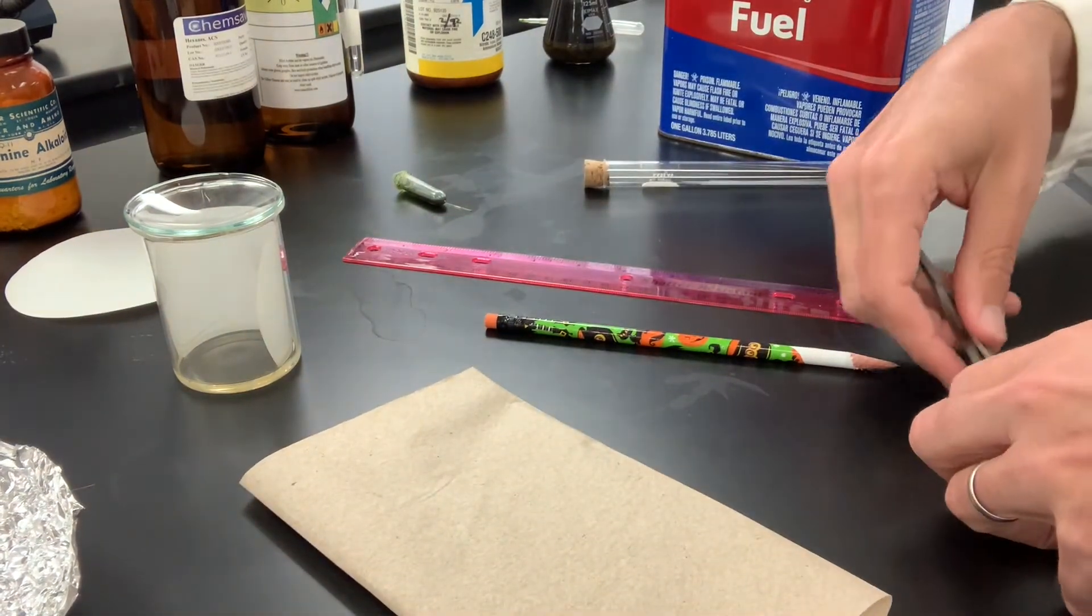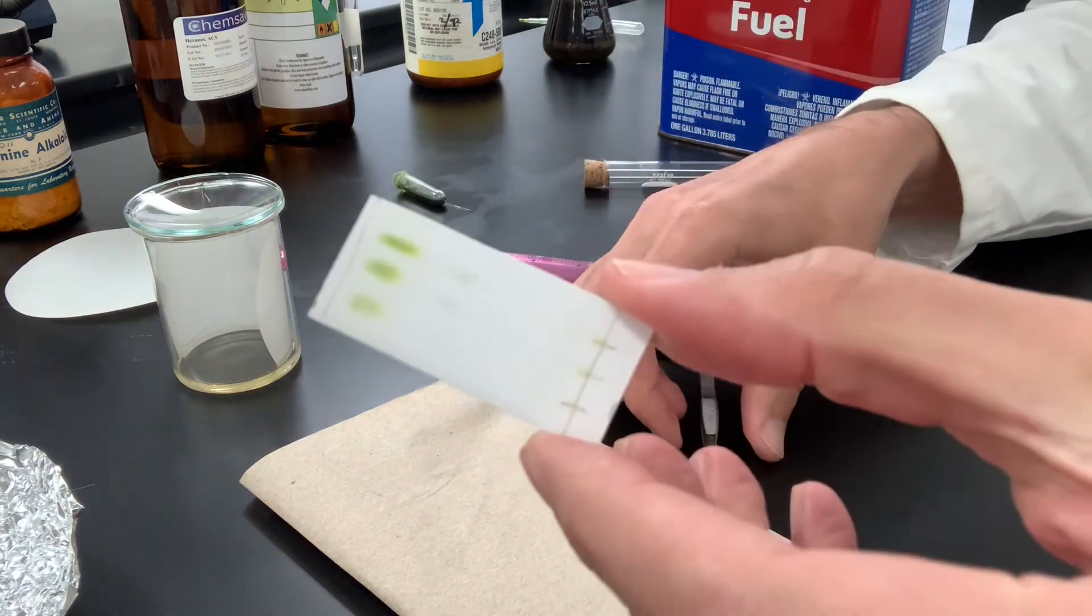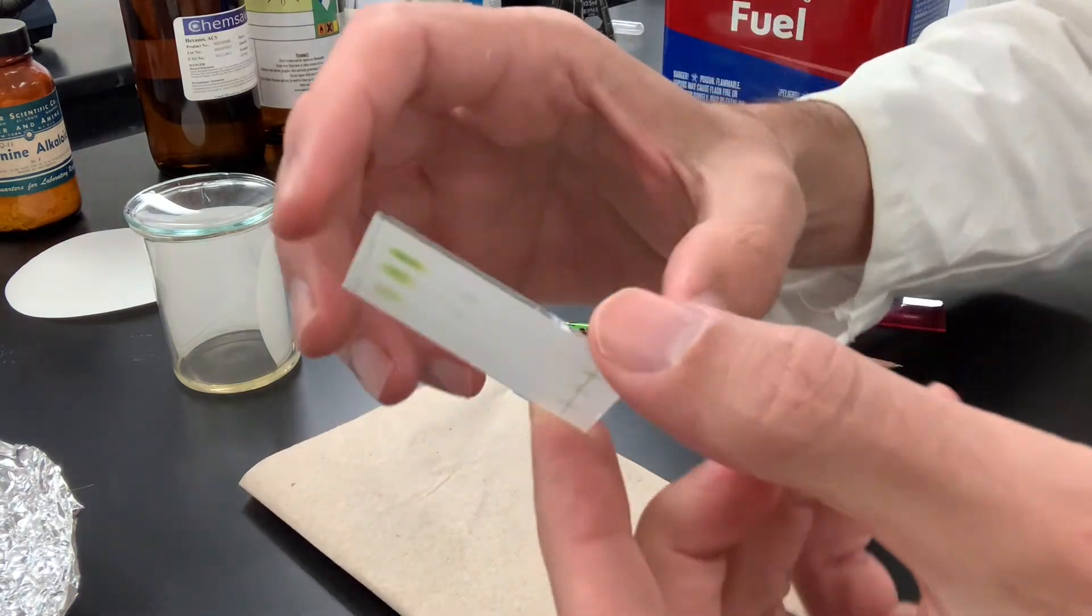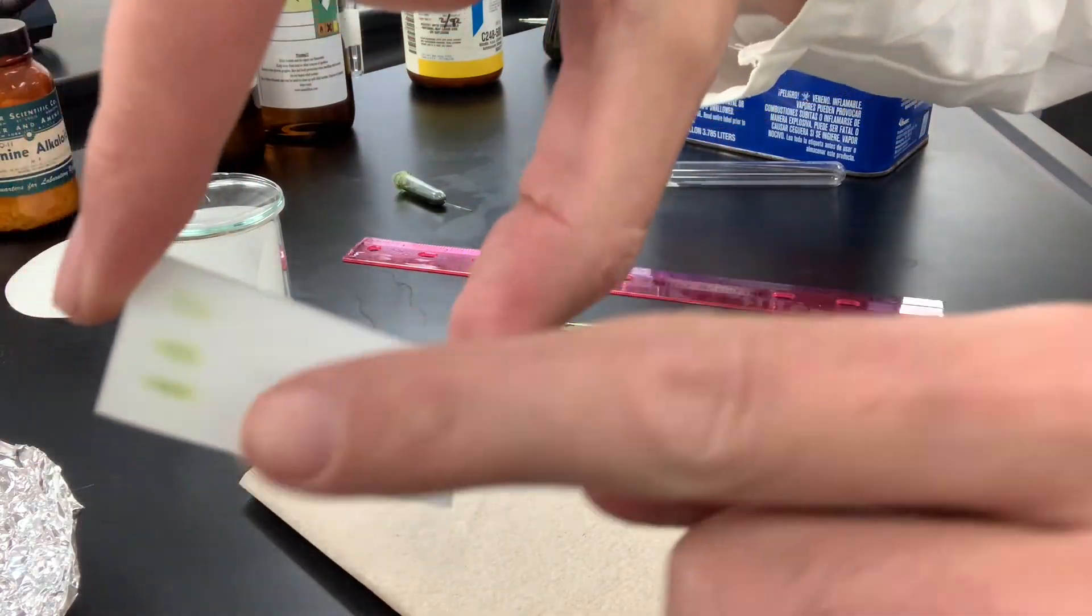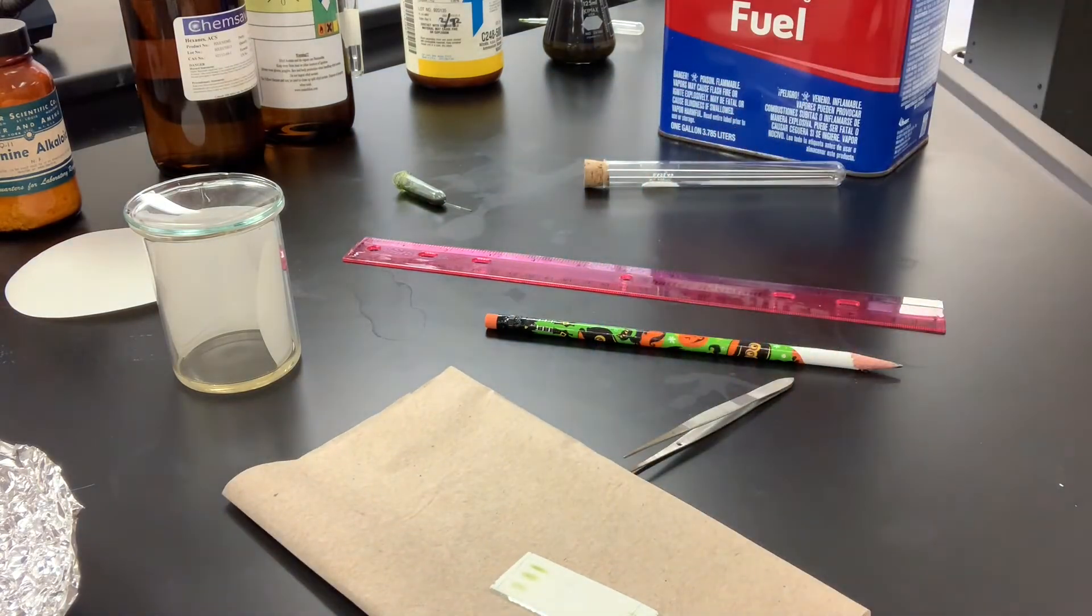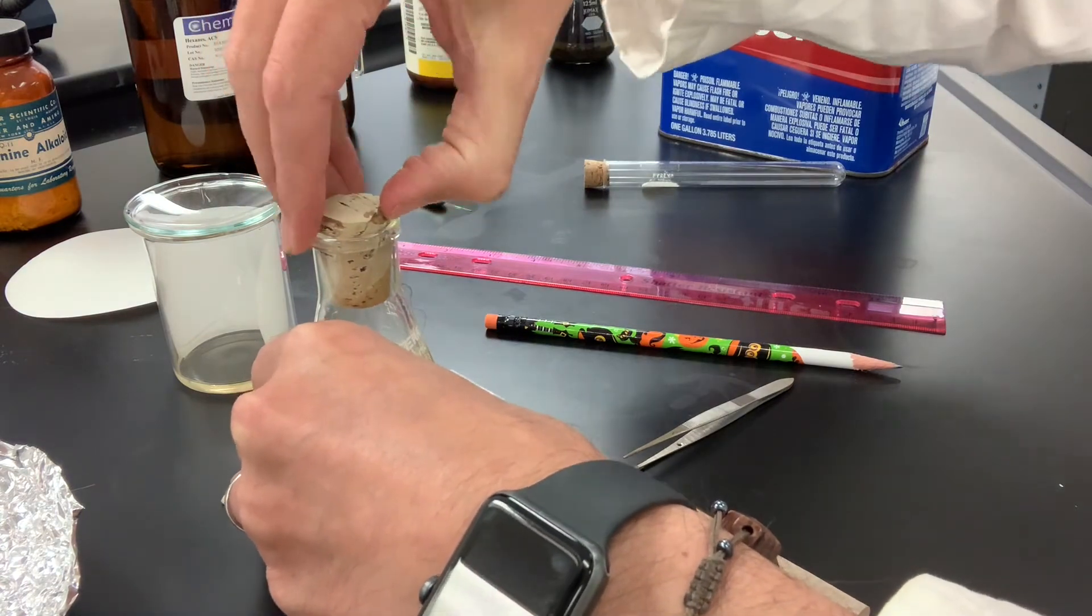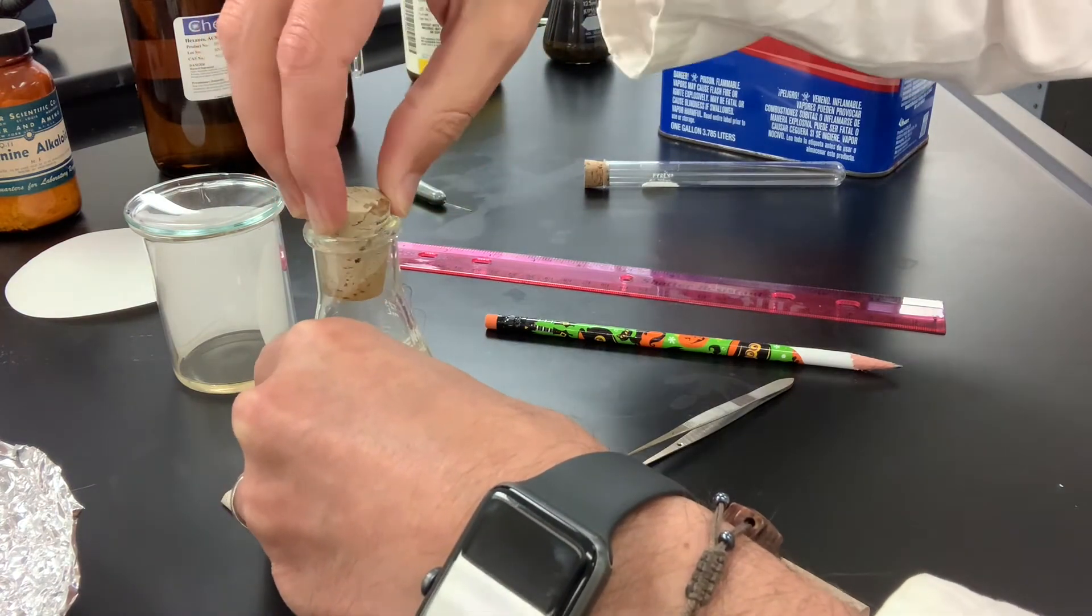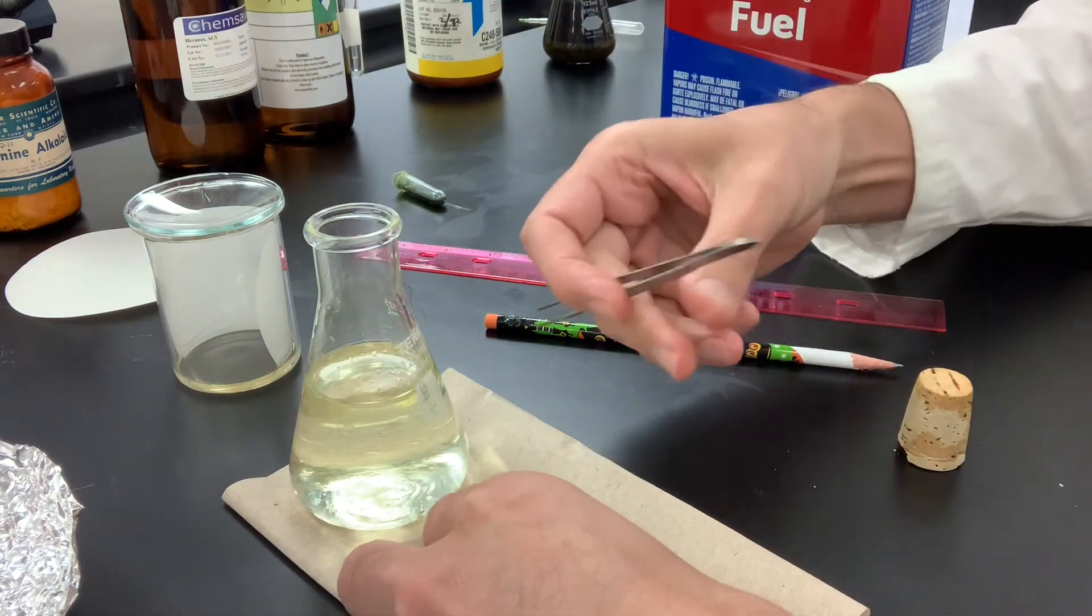The interesting thing about these TLC plates that have this glass backing to them is that you can observe on the top where the silica gel is, or you can observe through the glass, through the back. So I've got my 1% cerium ammonium and 50% phosphoric acid, and I'm going to dip this in here and we'll see what stains develop.